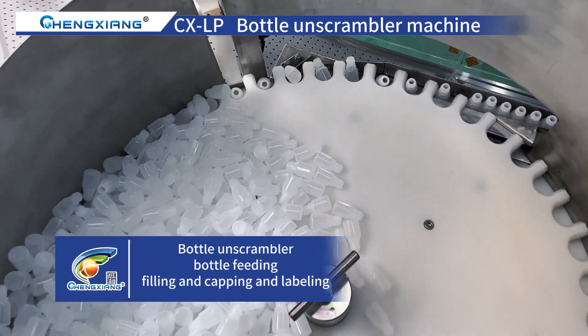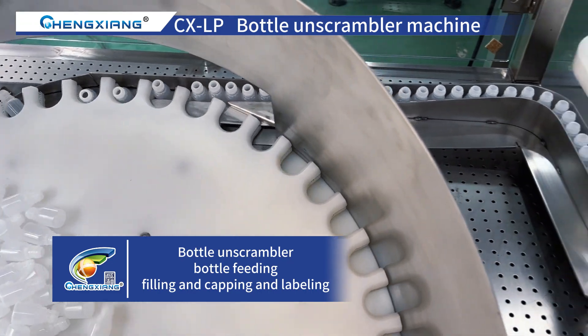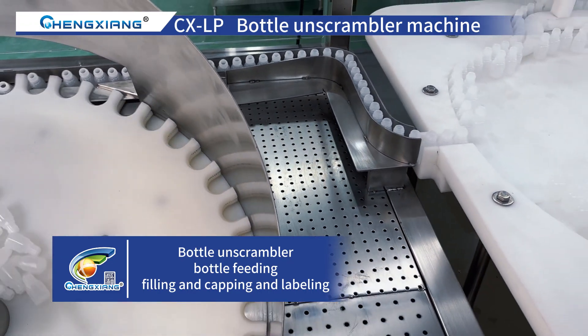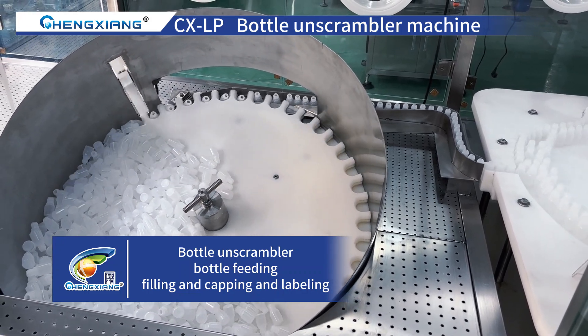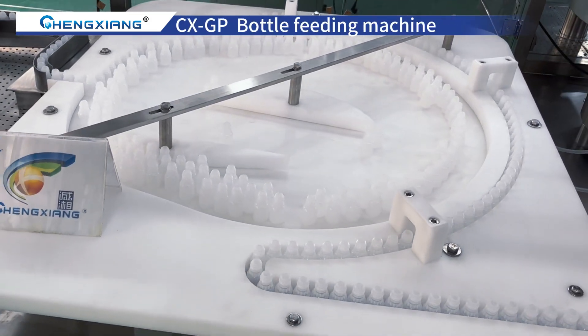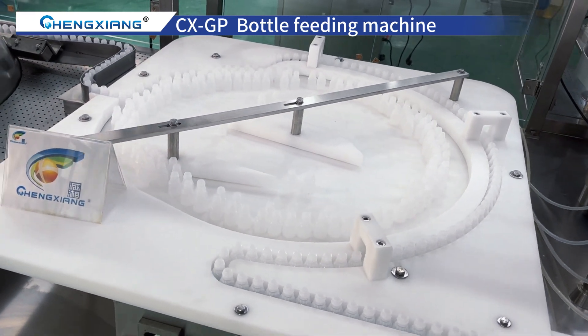Hello everyone. Today I will bring you the CX-YGF4 Automatic Eyedrop Sterile Filling Line of Chengxiang. The production line is composed of Bottle Unscrambler Machine, Bottle Feeding Machine, Filling and Capping Machine, Labeling Machine and Bottle Collecting Turntable Machine.